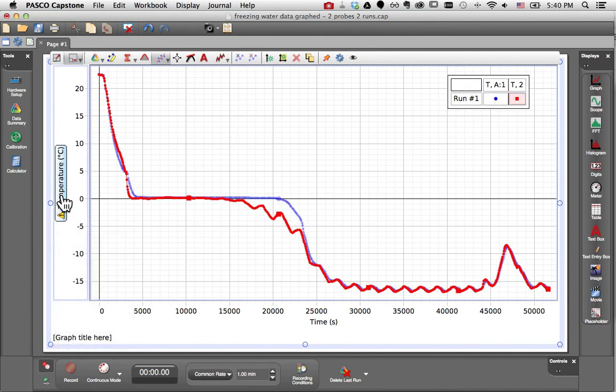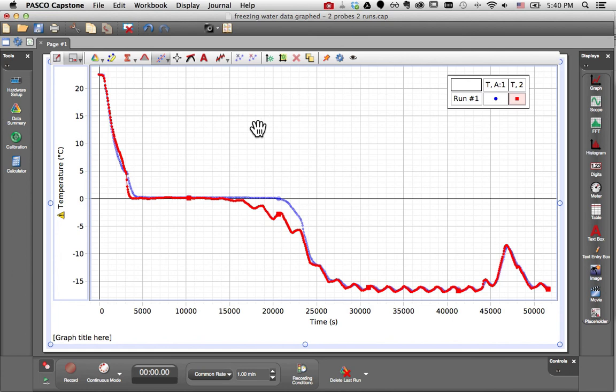Notice that the y-axis label here collapses to the common temperature measurement, and I can distinguish between the two probes here in the legend.